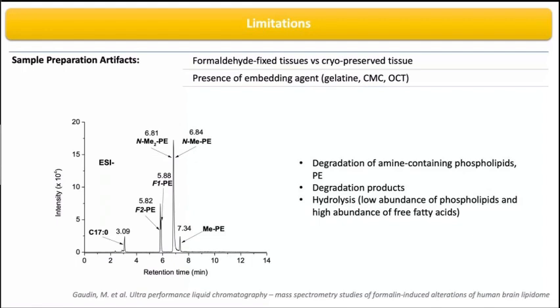Sometimes you don't have the choice. You really have to fix your tissue because you are doing your analysis days or months after, and you are risking degrading your tissue. Sometimes you don't. But it's important to take into account that several lipids could be degraded due to this approach. And with that limitation, I conclude my presentation.